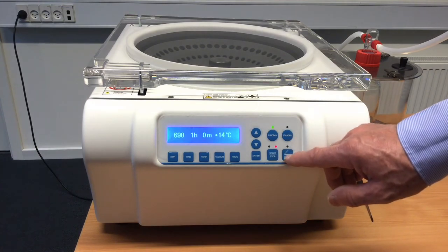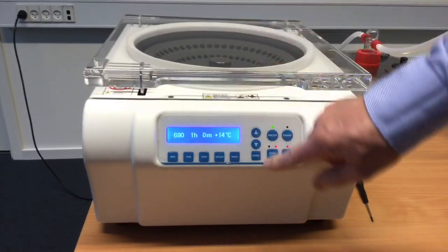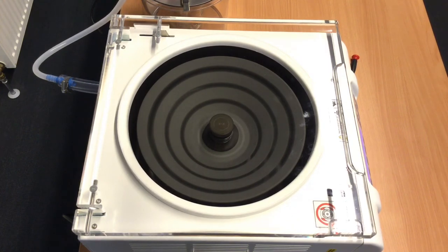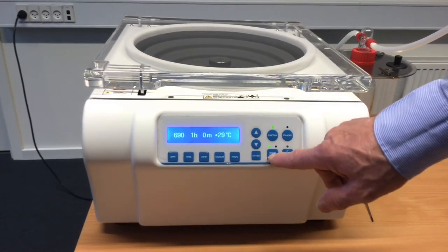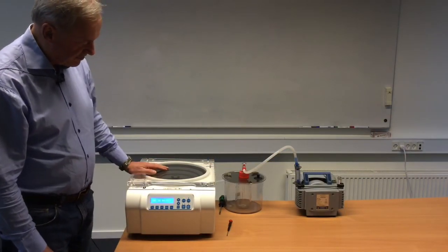So we can open the door, close the door, and start. The speed will go up to 690 RPM, and when that speed is reached, the pump will then start. It will work for one hour. Or we can just stop it — the pump will stop immediately and the rotation will slowly stop.